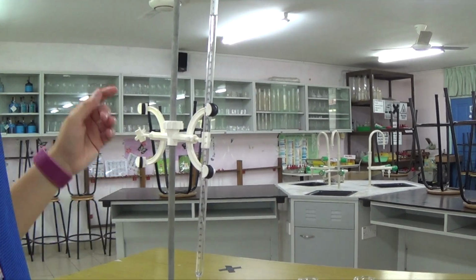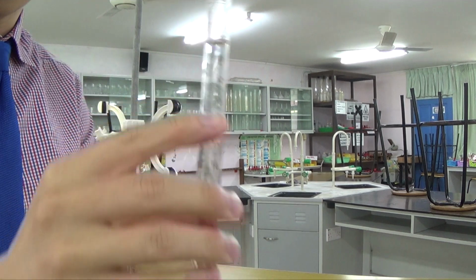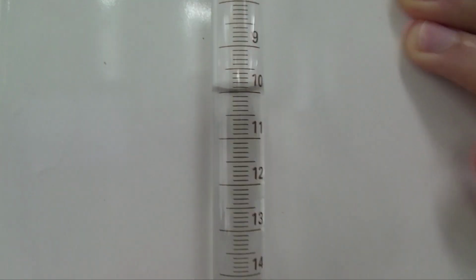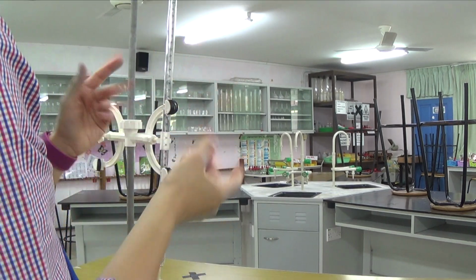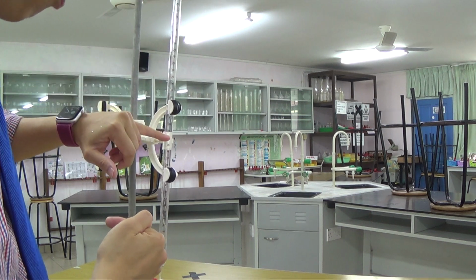Alright, so let's just get started with these titrations. I need to double check my initial volume. There is 10.0 cm3, not too sure if you can read properly. So you will fill in your table as you go along. My rough titration was around 23.7, so 10.0 plus 23.7 should be 33.7.